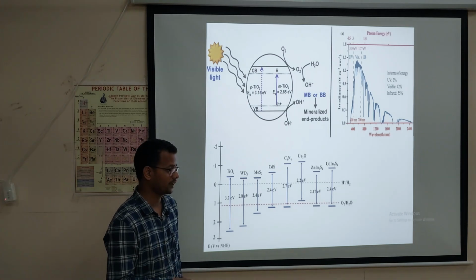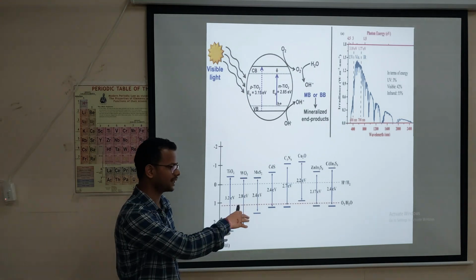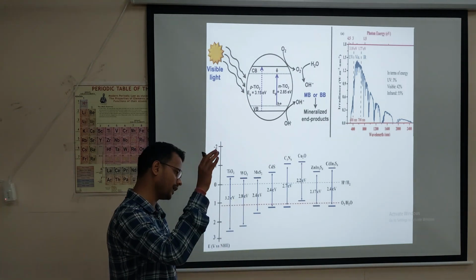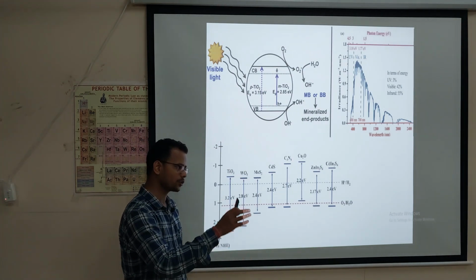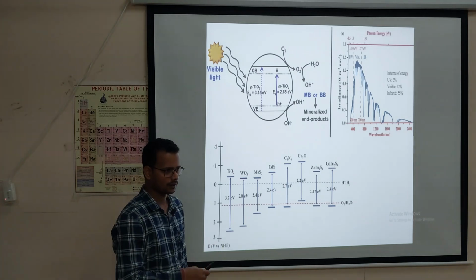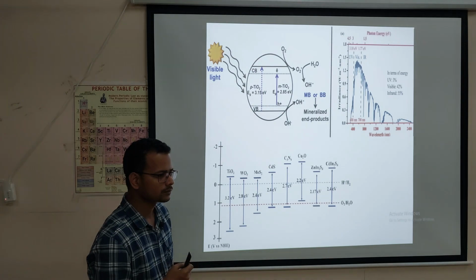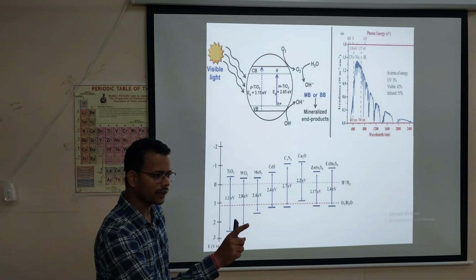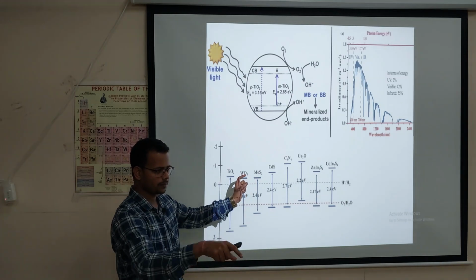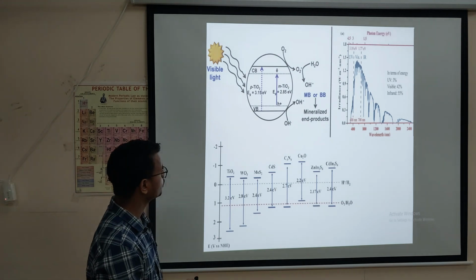Not only from Mott-Schottky, but from Mott-Schottky and UV visible DRS. From UV visible DRS I will explain that later, you just wait. We can know the band gap as well as VB and CB, but in addition to the Mott-Schottky analysis data. If we get any one, we can get the other, because the band gap is known. If we get VB, we can get CB. Okay, next.